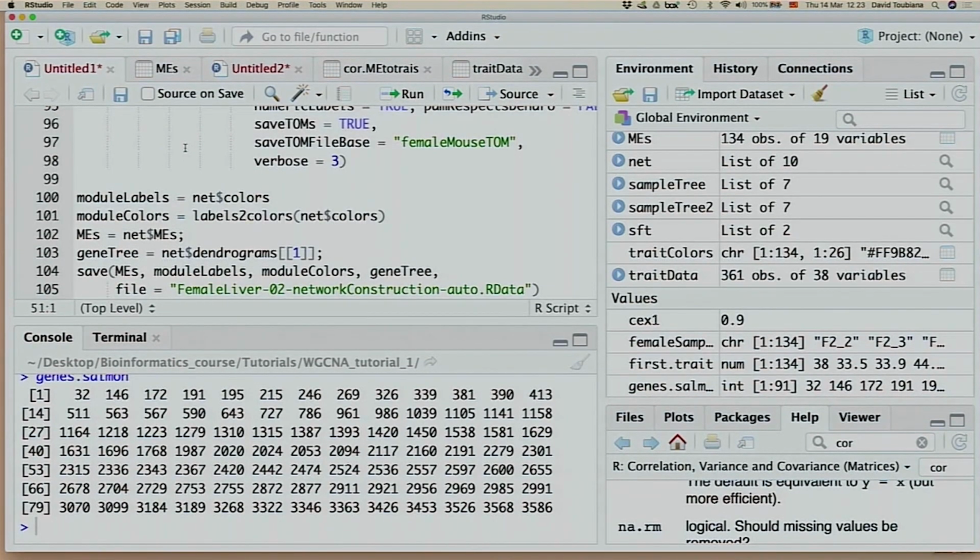Then it becomes very difficult to identify single genes. According to the method of WGCNA, you sum up the correlation for each gene in your module, and the one that gives you the highest sum is the hub gene that will have the highest impact on the trait you're looking at.